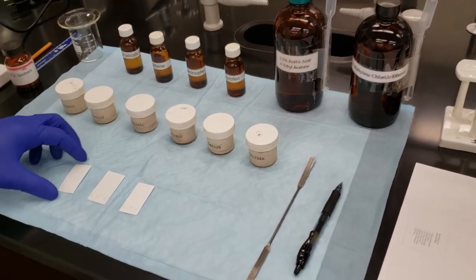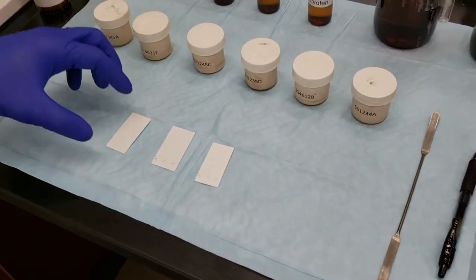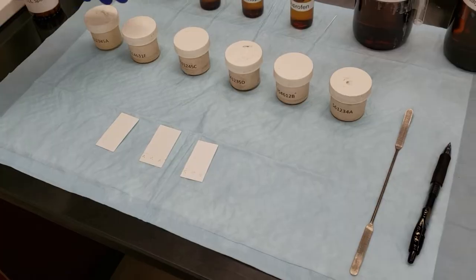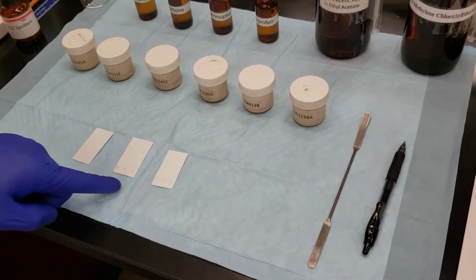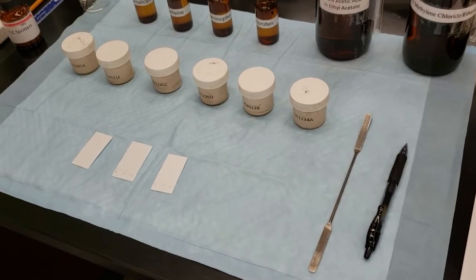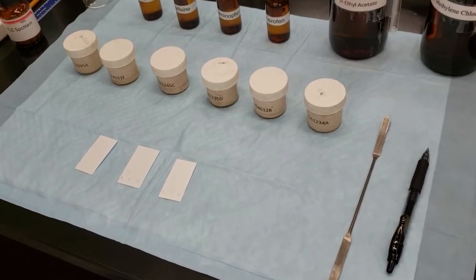So we're going to spot these known solutions onto one plate. We're then going to make up a series of spotting solutions for our unknowns. We're going to spot those on two additional plates and compare the RF values to help us identify our unknown codes.